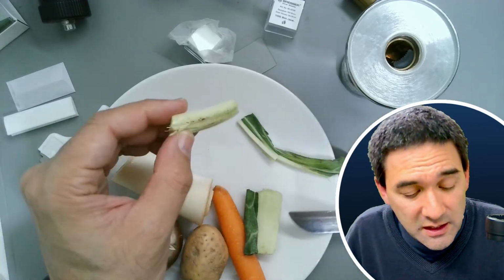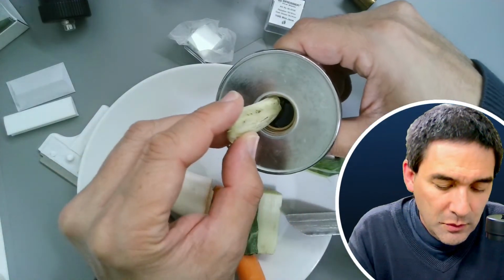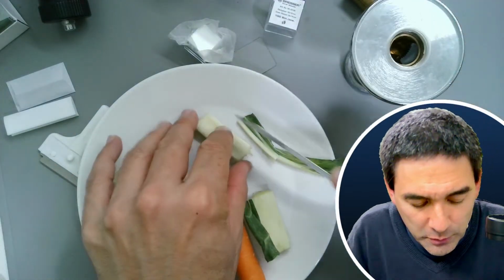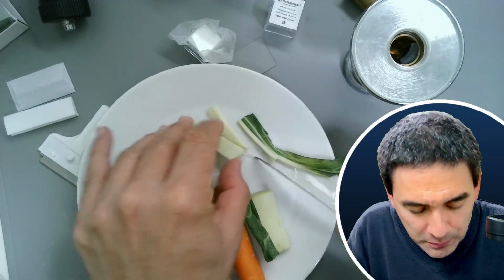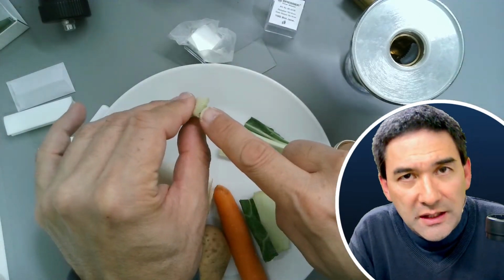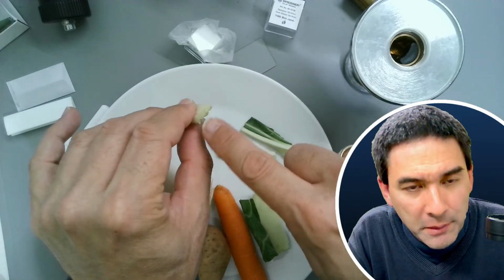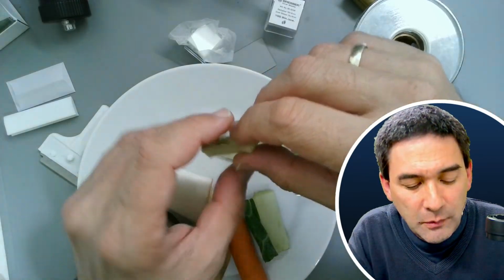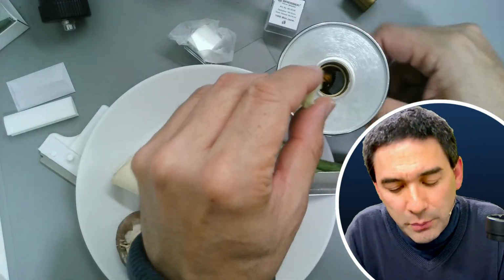You do not want the specimen to touch the sides too much, otherwise there's going to be too much friction and it's not able to move out properly. And of course, what I hope to be able to see are the vascular bundles of this plant. The vascular bundles are those parts where water and nutrients are transported.